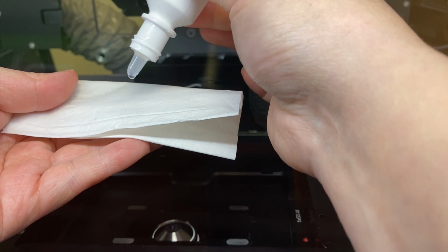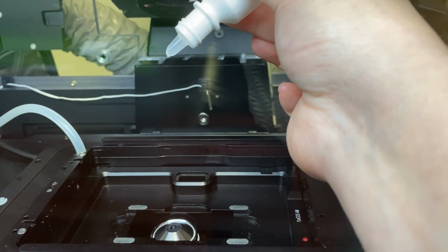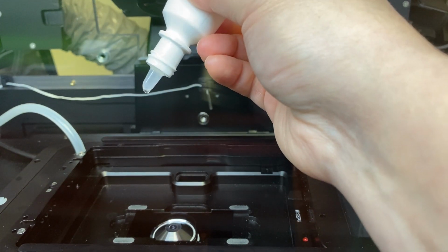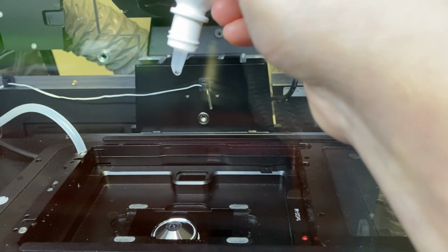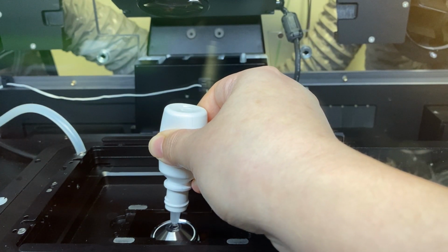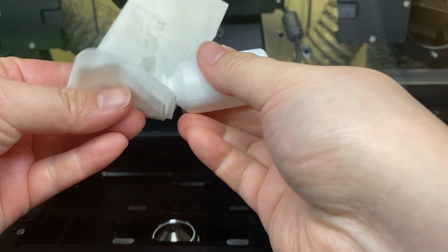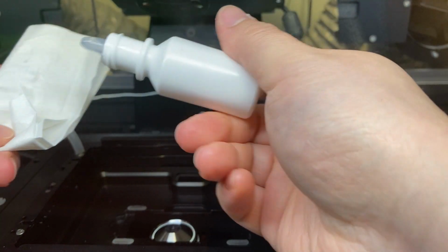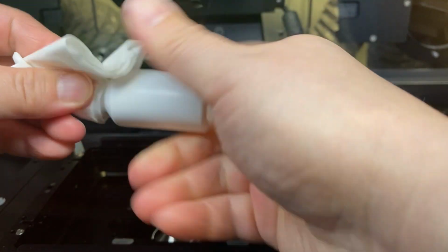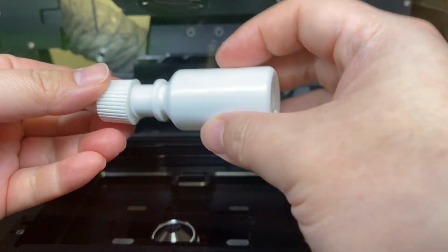If you do see air bubbles, please wipe it on a bit of tissue and then carry on. You want to put about half a drop of oil onto the lens. Be careful only to touch the lens with the oil. And if the bottle is dirty, please give it a clean for us. And put the cap back on.